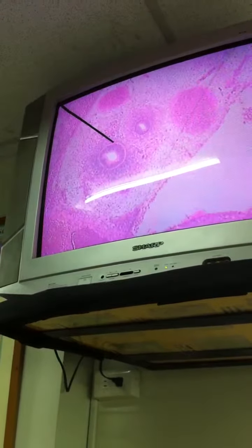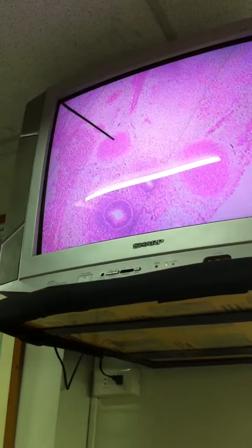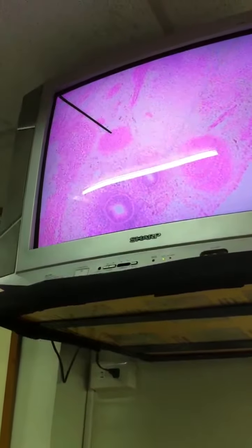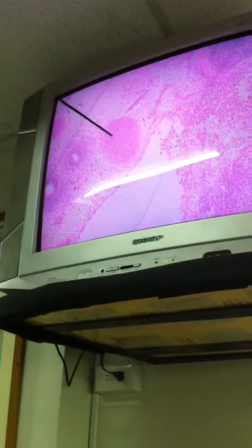Now, at the level of the trachea and the esophagus, note these two round structures. These are actually arteries. Specifically big arteries, these are aortas. This is the right dorsal aorta. And this is your left dorsal aorta. So we have two big vessels seen in this view. You have your right and left dorsal aorta. So do not forget to identify this in this view.